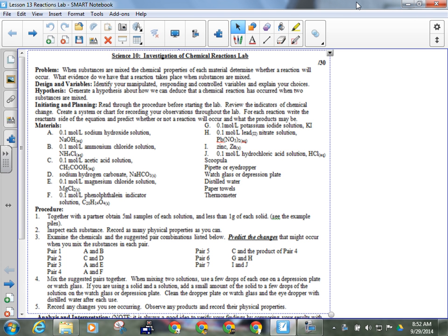They all have two of these little disposable eyedropper pipettes in them. The disposable eyedropper pipettes are also labeled in permanent marker on the bulb. So when you're squeezing them, squeeze away from the lettering, because even though it's permanent, it came off on my fingers this morning. The reason I have done that is so that you make sure the eyedropper gets back in the right container each time.